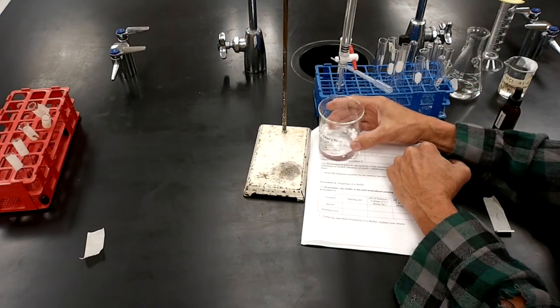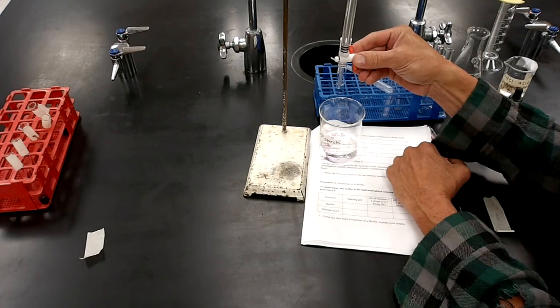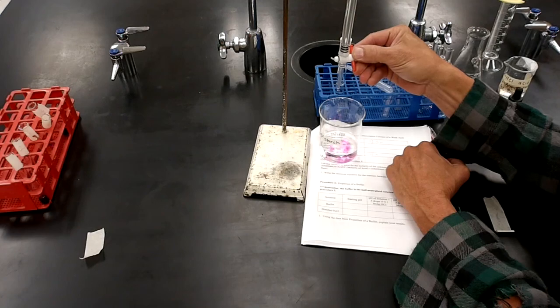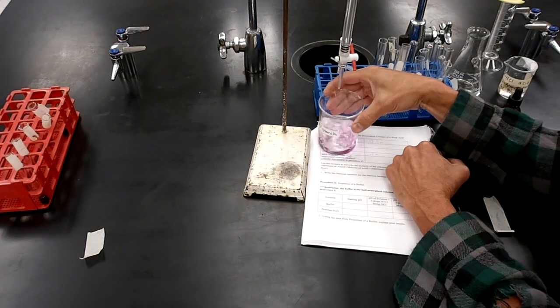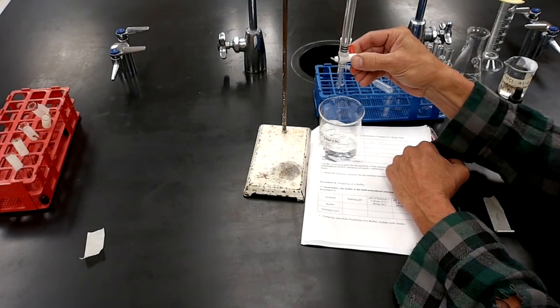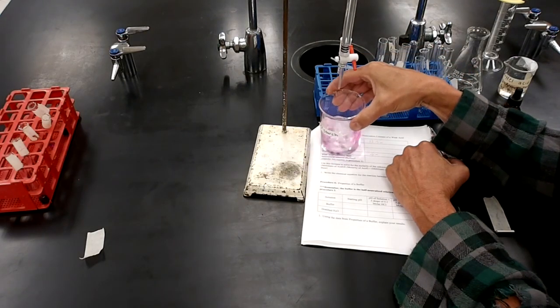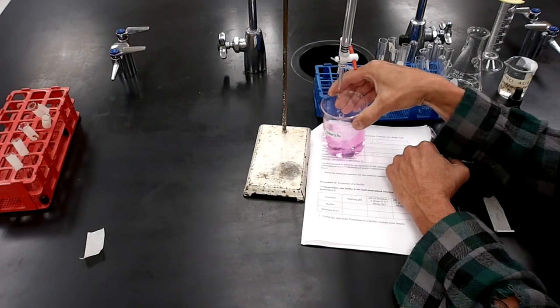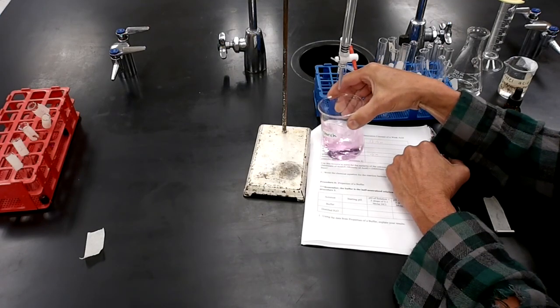Slow it down a little bit because it's taking it longer to clear up. Start to take pink longer. Won't take much more. Another drop, maybe two. Oh, see, it's staying pink now.